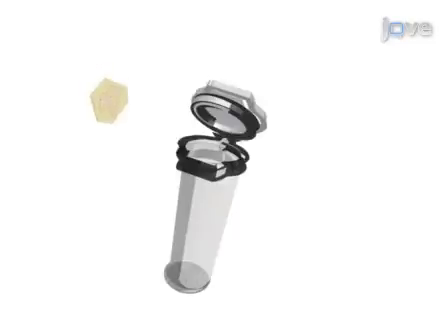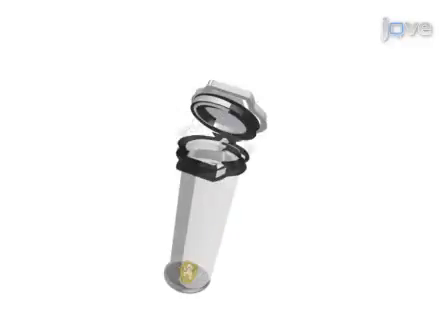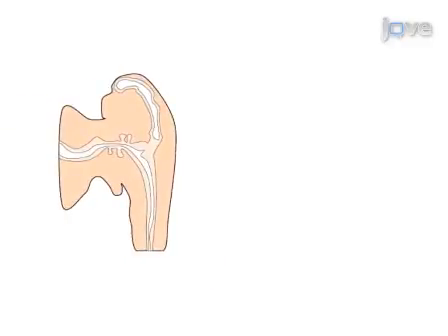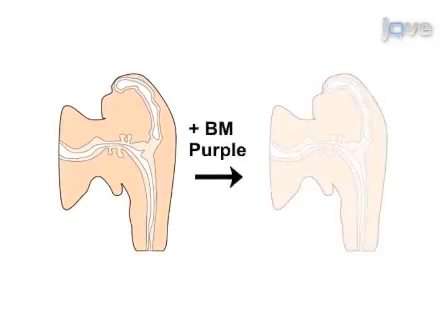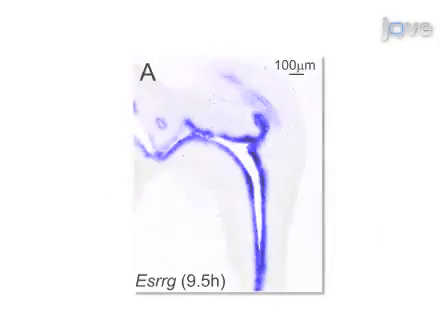The third step is to conduct an in situ hybridization in lower urogenital tract sections contained in customized baskets. The mRNAs are visualized through immunohistochemical detection of bound riboprobes using BM-purple precipitating alkaline phosphatase substrate. Ultimately, microscopy can show the spatial and temporal localization of low and high abundance mRNA transcripts in the fetal mouse lower urogenital tract.